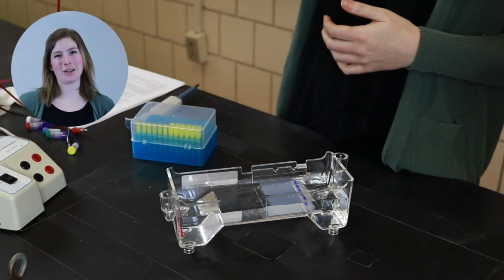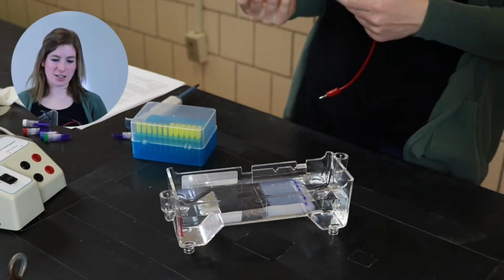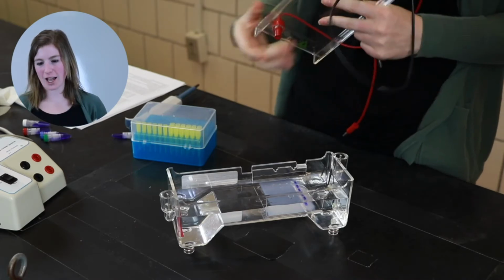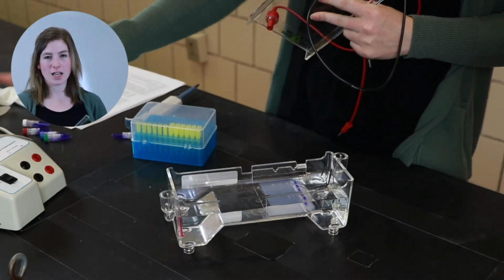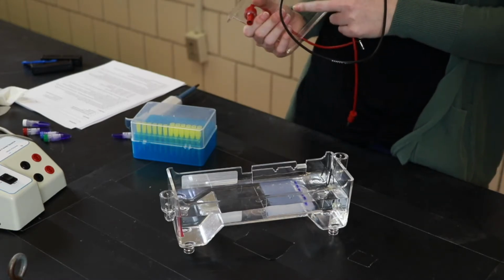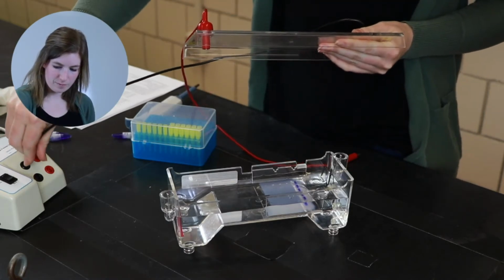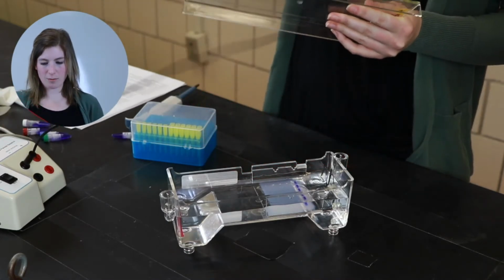All right, let's keep going. The lights are back on now. So the last piece I need to do is I need to actually hook this up. And so I have a power source here, and I have a place to plug in both my black and my red electrode. So I'm going to plug in my black one first, and then I'm going to plug in my red.